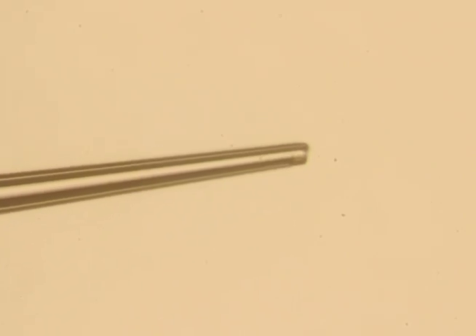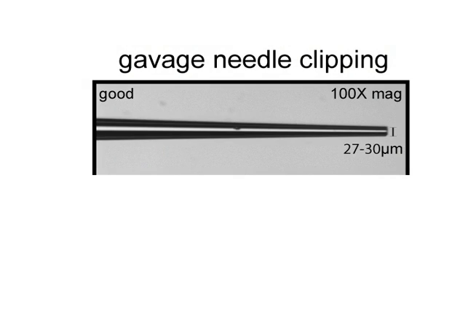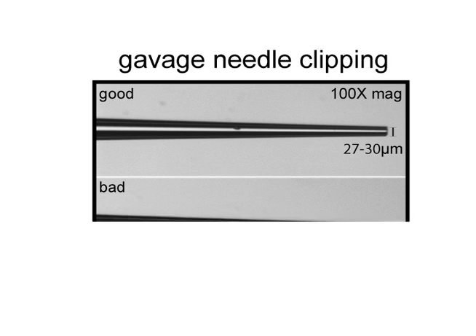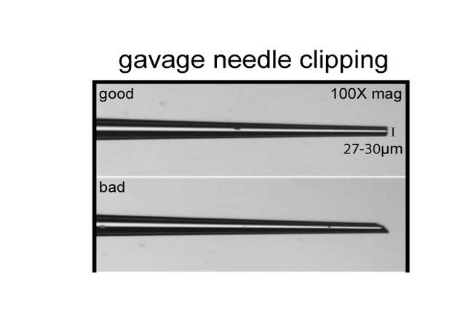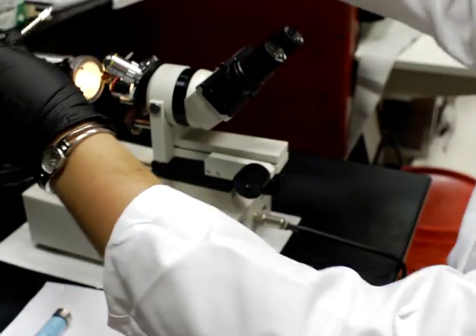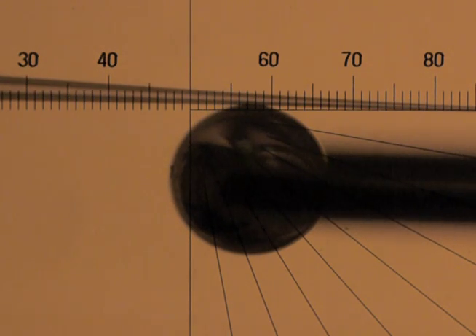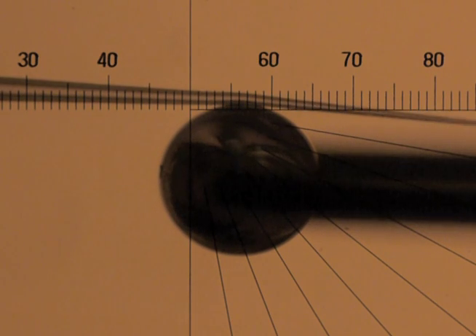Examine the needle tip at 100 times magnification. The needle should be around 27 to 30 microns in diameter and blunt. Sharp or jagged needles should be avoided. For more consistent results, a microforge can be used to better control the needle clip point and to fire polish the needle tips to remove sharp edges.